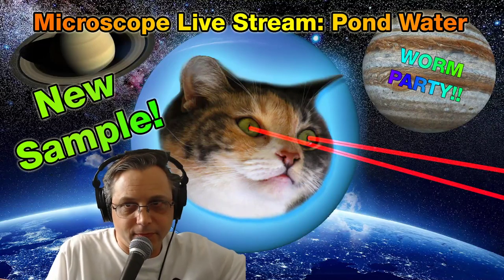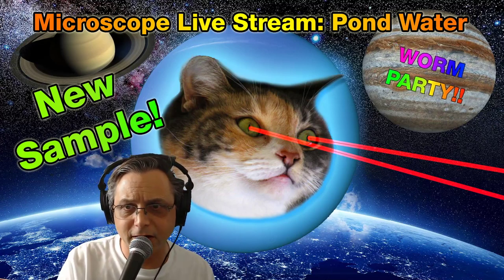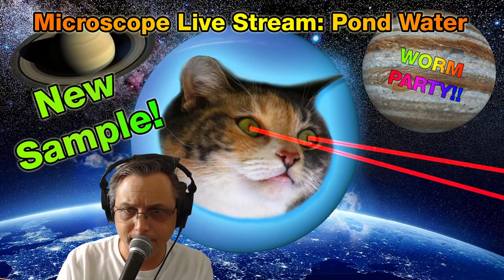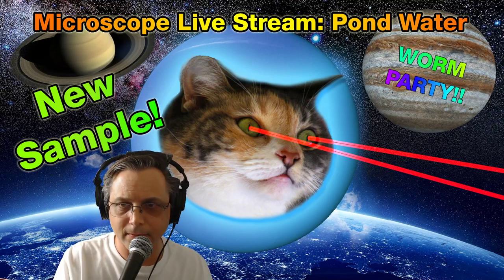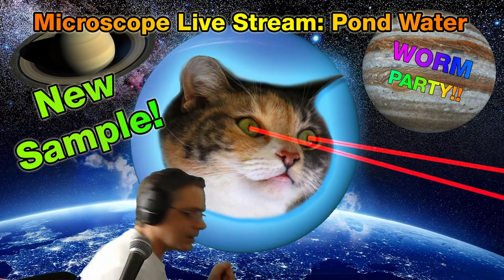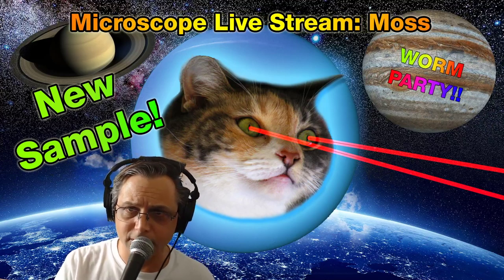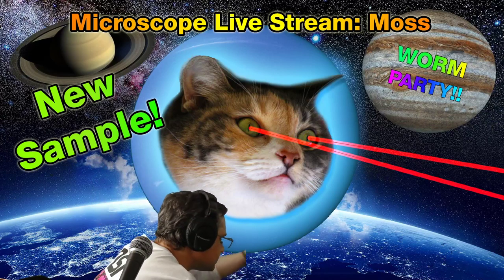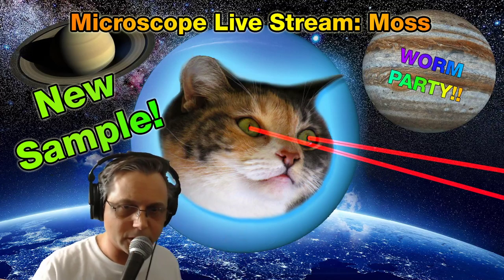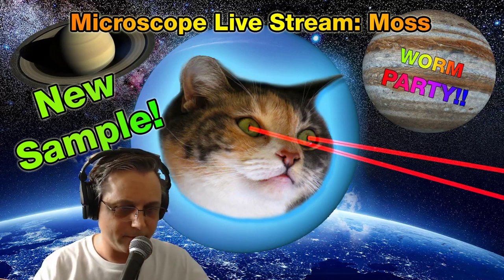All right. So that's the pond water under a flat slide with a cover slip. Some music while I prepare a new slide. We're going to go for the moss this time. So I'm just going to change that up. I want to look at the tree moss. Collected moss from two different trees.